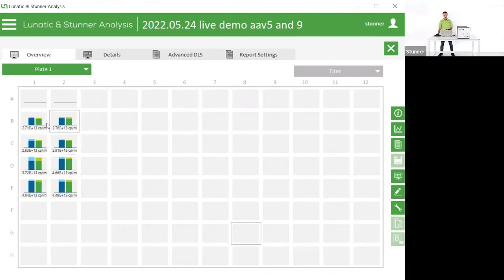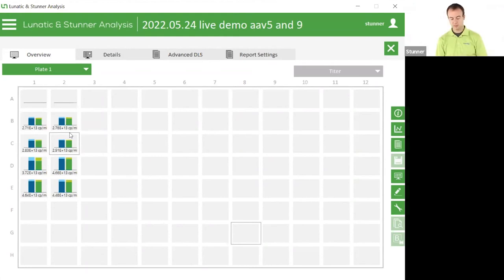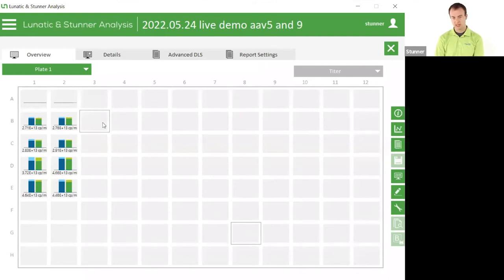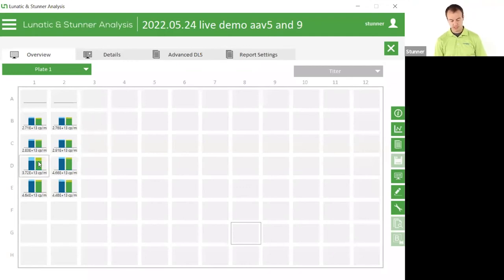The first screen that we're seeing here is the analysis of the capsid titer on Stunner. For these quadruplicate replicates, we're getting capsid titer results at about 2.8 E13 capsids per mil. Because we're running in quadruplicates, you can actually see that the precision has about a 2.6% CV, which is pretty impressive for a capsid titer that you're getting at about 45 seconds per sample with no real sample prep. Even the bottom sample has a little higher CV, but it's still 8.8% CV - very typical to see results in the single digits.